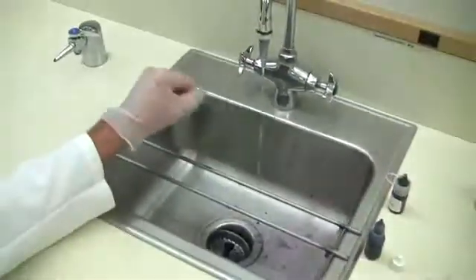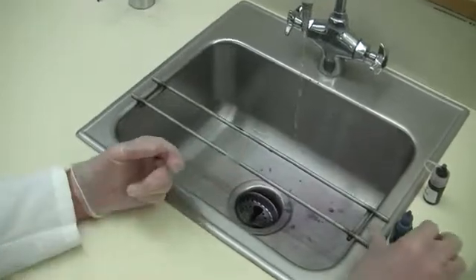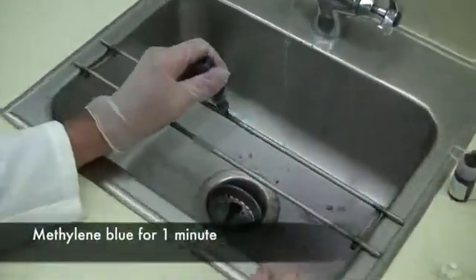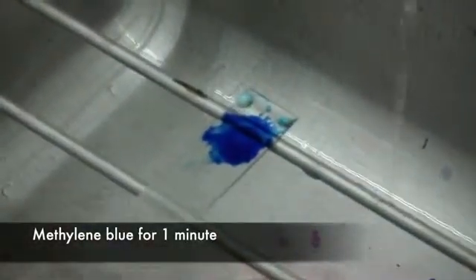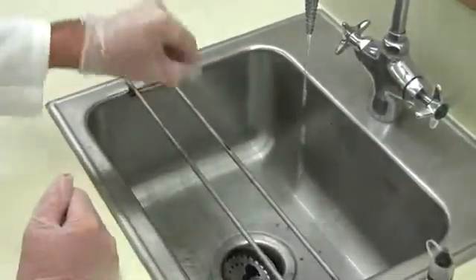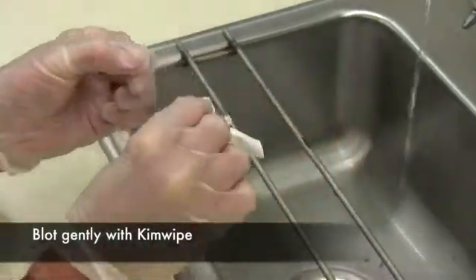Shake off the excess water. The last step will be methylene blue — cover the smear with the methylene blue and leave it on for one minute. After one minute, rinse off the methylene blue from the slide, shake off the excess water, and then blot it gently with a kim wipe until it's dry.